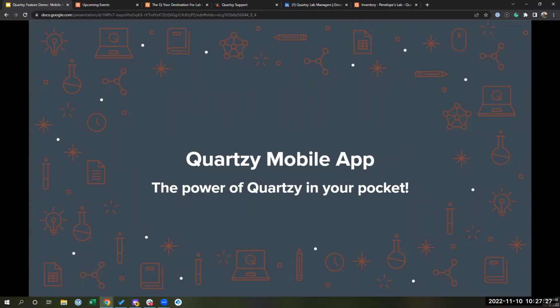Yeah, and I believe wasn't there one? Oh, I think you already addressed it, Samantha. Never mind. Yep. And then will the serial number be different every time for the same product?